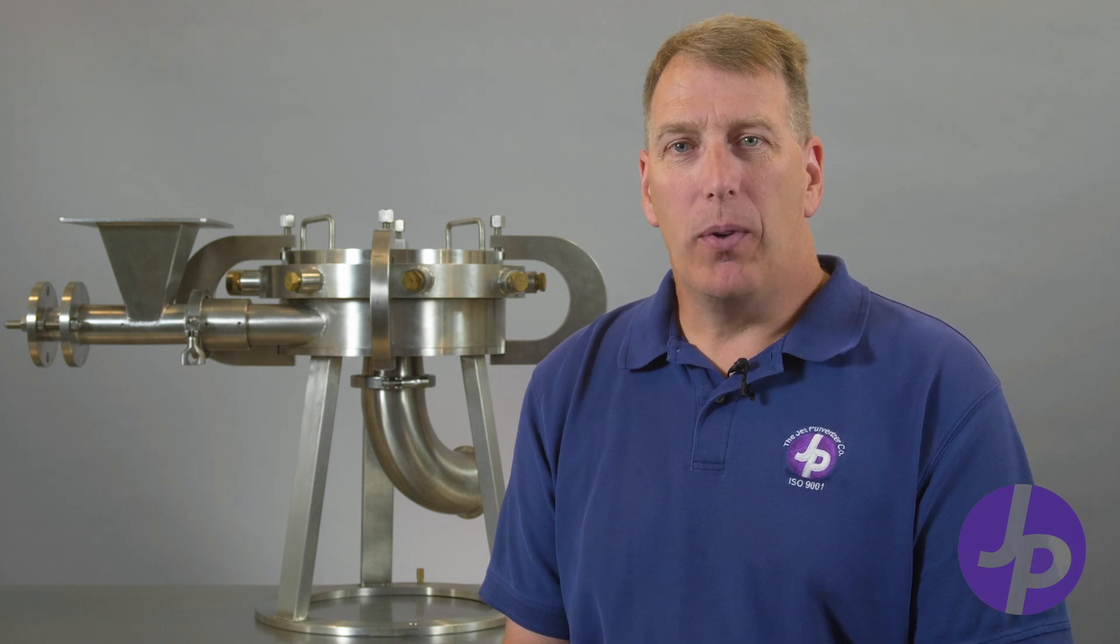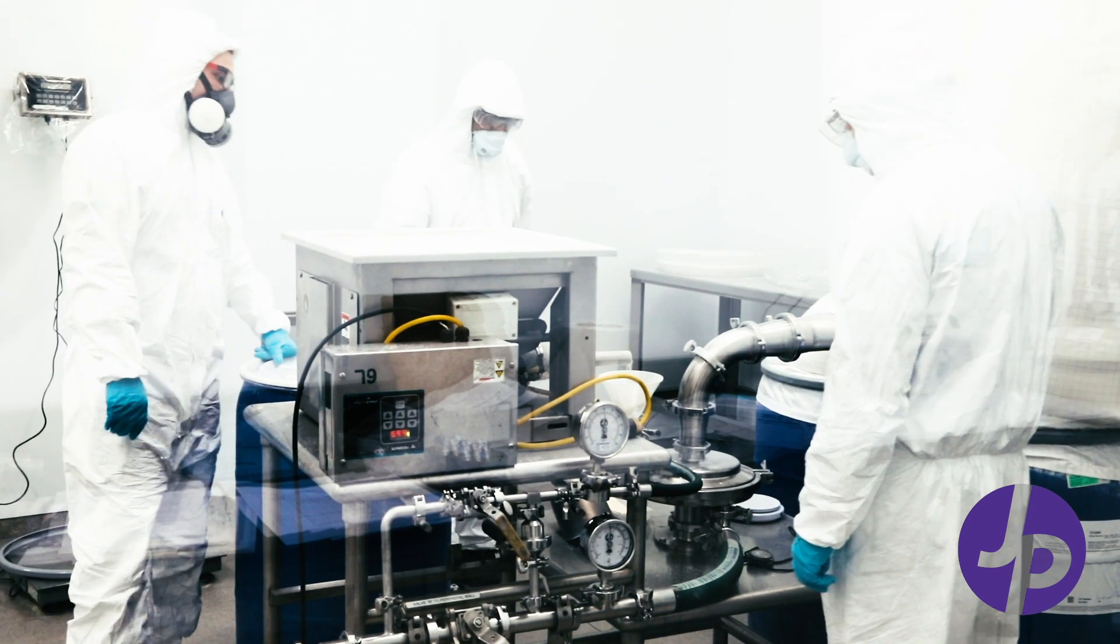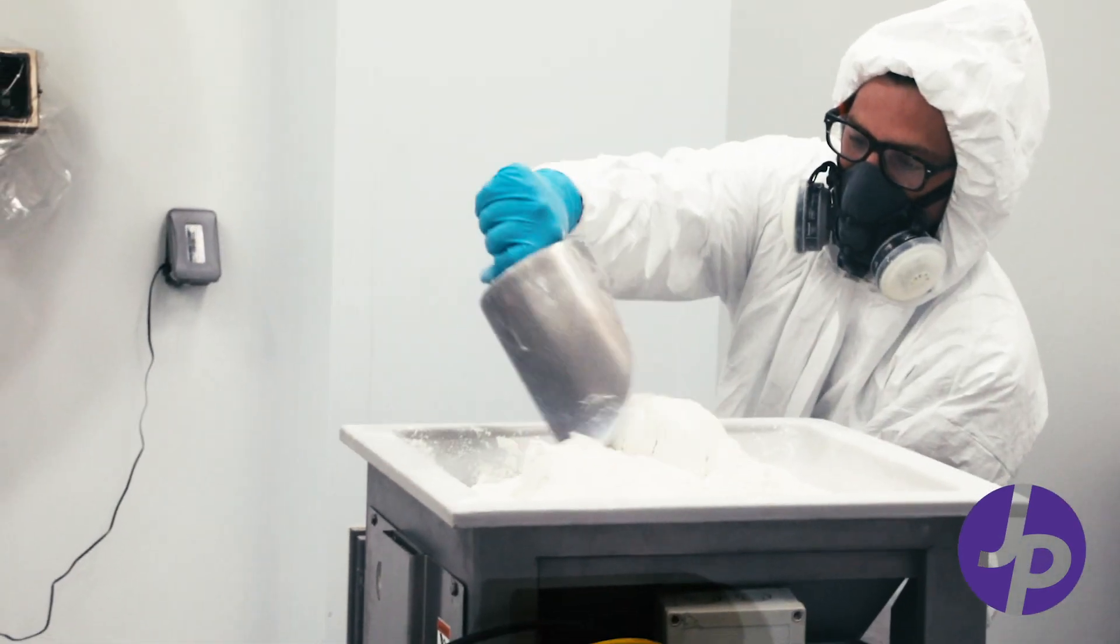We have one GMP station here at Jet Pulverizer. It is an ISO-8 room, class 100,000, that we utilize for production of our GMP materials.